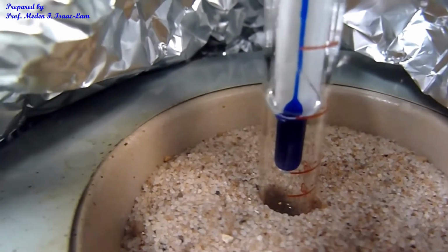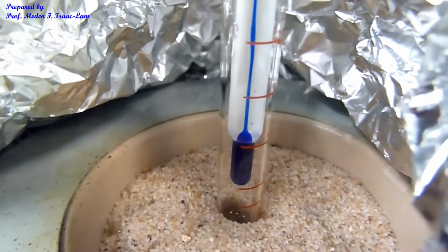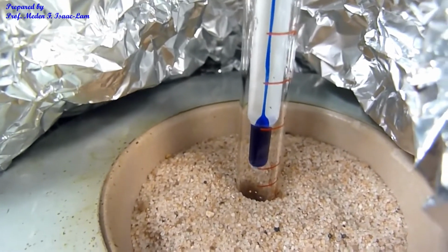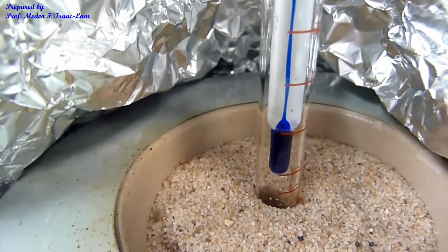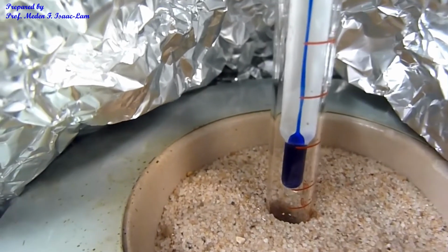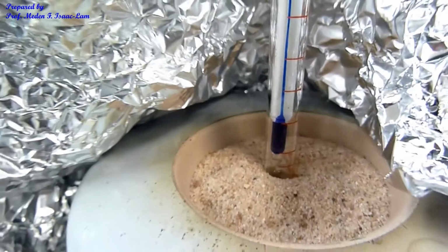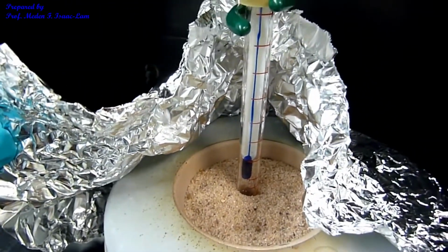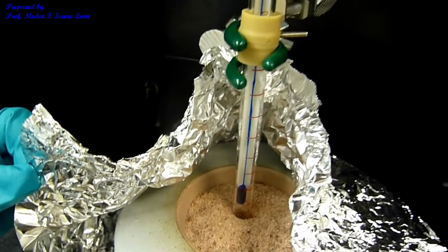So it's washing the bulb, and the thermometer bulb is measuring the temperature at which the sample or the liquid is evaporating and condensing. So it's kind of like refluxing. So it's the boiling point of the liquid. So again, the boiling point is the point at which the temperature was steady at about 5 to 6 minutes. If it doesn't go up, then that's the boiling point of the sample.